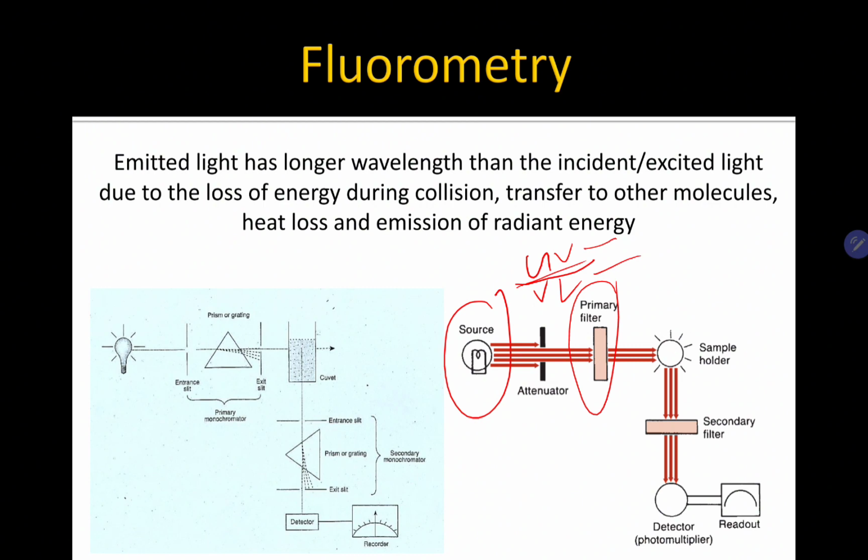Okay, so since mag-undergo siya ng fluorescence, there are some lights na ma-emit, in the photons in the form of light. Okay, and then they will undergo secondary filter. The secondary filter here is there to stop unwanted lights na pwedeng makaano sa right angle, yan sila nakaposition, guys. The secondary filter there is nandyan siya to stop the unwanted light.